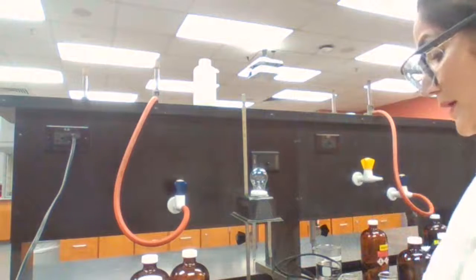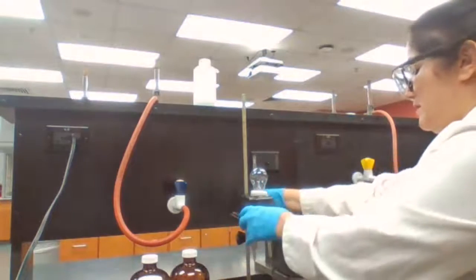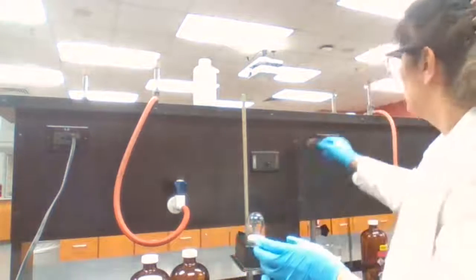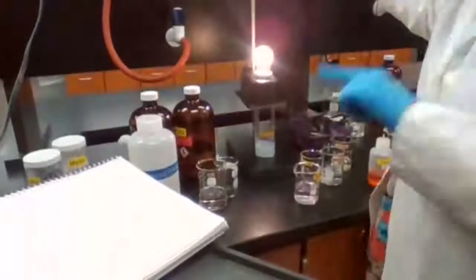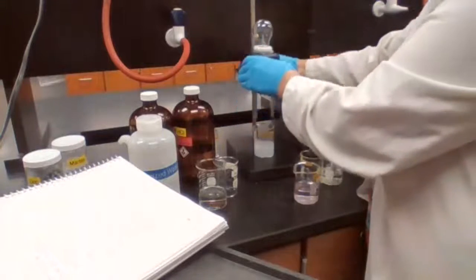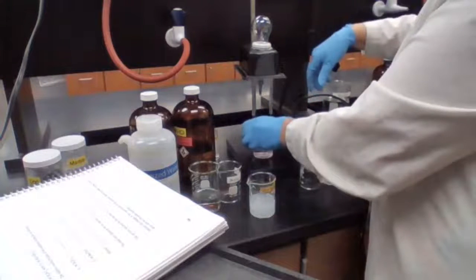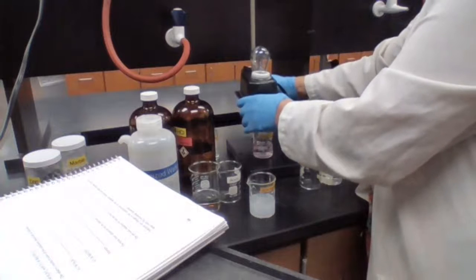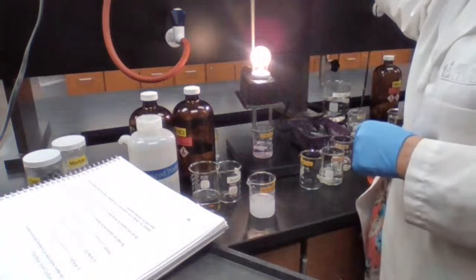Right. Okay, so I'm going to test the barium hydroxide for you. Barium hydroxide is a strong base. Separately, this is the reactant, barium hydroxide. And I also have sulfuric acid. Sulfuric acid is also a strong electrolyte separately.